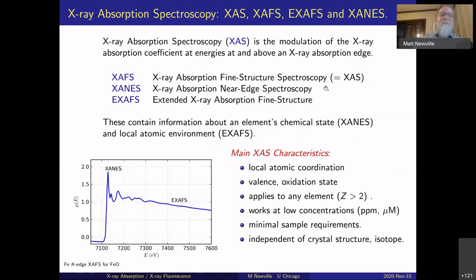Okay, let's get started. X-ray absorption spectroscopy includes XAS, XAFS, all these different acronyms, some for X-ray absorption spectroscopy, sometimes with the words fine structure in them.